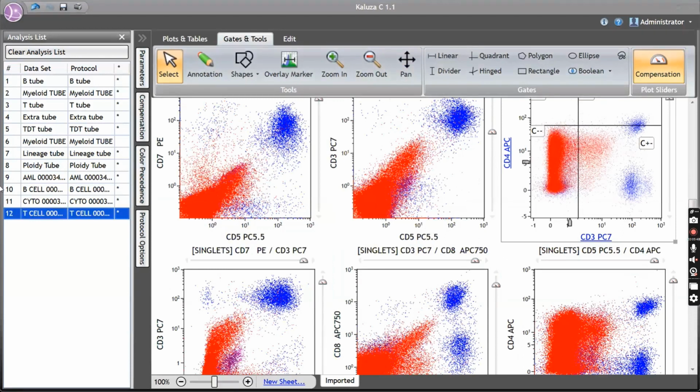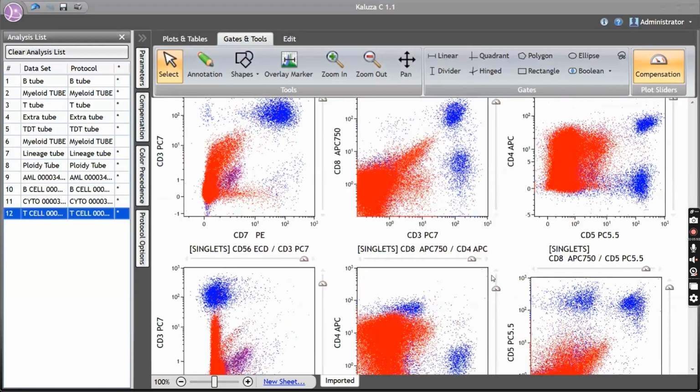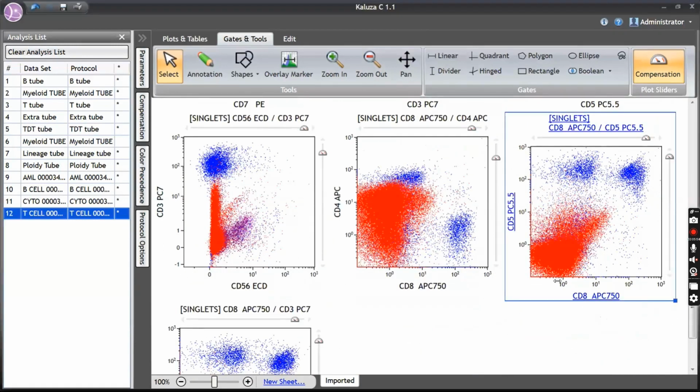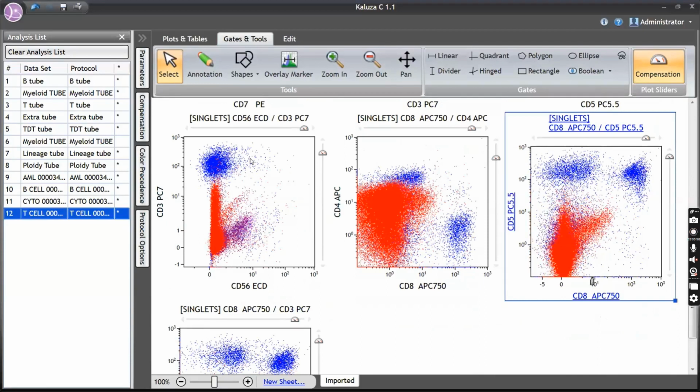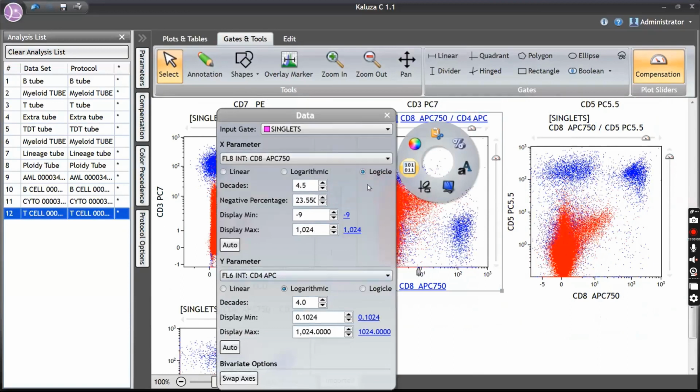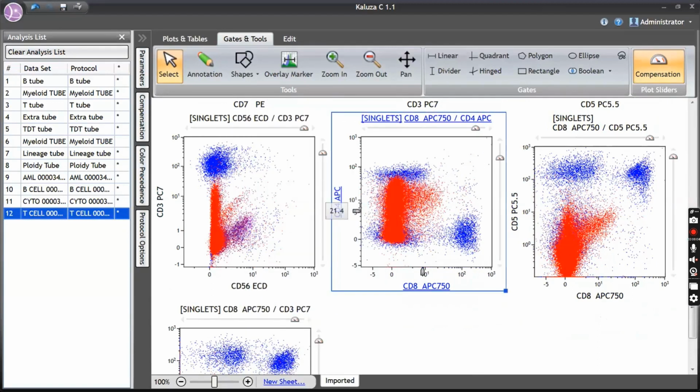But with the plots and whatever you've given, I feel the internal controls are in place, so I'm happy with that. With the available plots, I would definitely give this as B-ALL with aberrant myeloid markers. And was FISH done? Sir, that I don't know. I will just check.